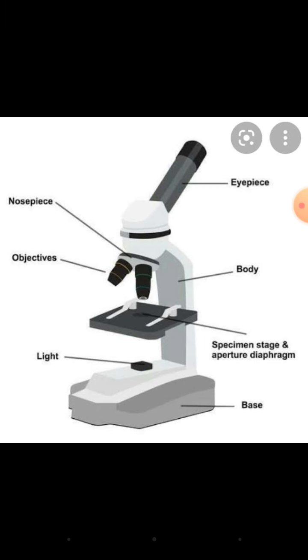The main components of the light microscope are eyepiece, lens tube, objective, revolver, stage, condenser, fine focus, coarse focus, luminous field diaphragm, and light source. The main things are the light source and the lens. The first microscope that was invented had only a lens tube, a base and a light source.